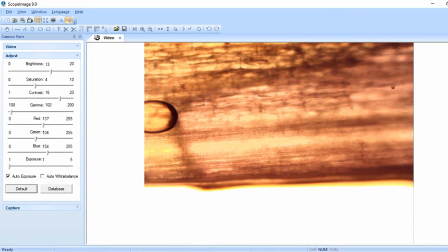But yeah, so we have interesting vascular tissue in these leaves, and that's just really cool. That's all I wanted to do.